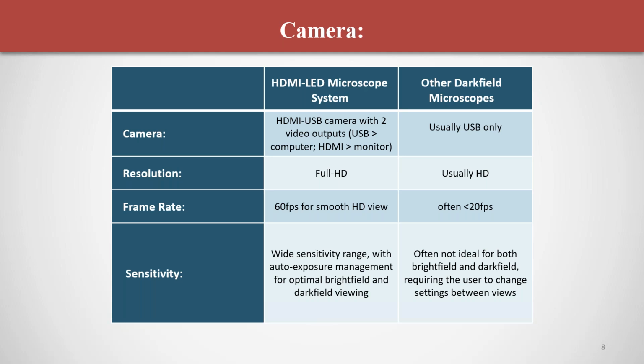Thank you. And what level of magnification would be required to see individual damaged cells? So for most of your live blood anomalies, 1,000 times would be sufficient. Ideally, we'd want to get about 1,500 to 1,600 times. That gives you that view where you're able to see the details of the cell membrane quite clearly.